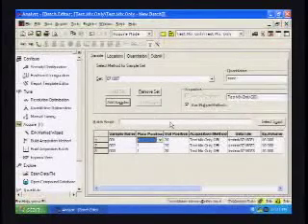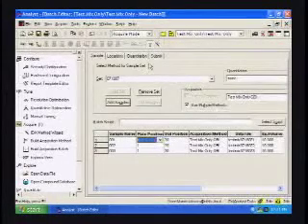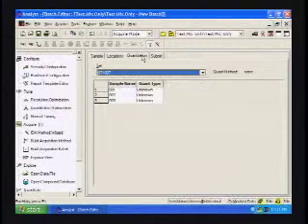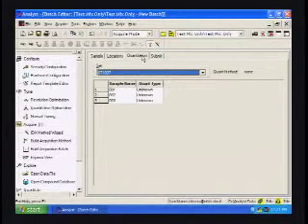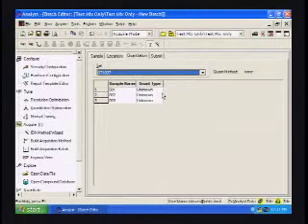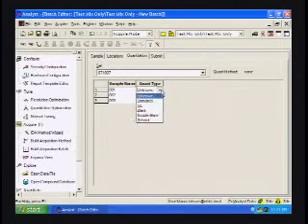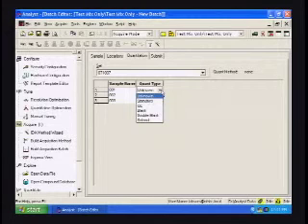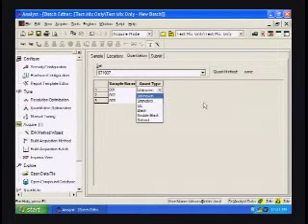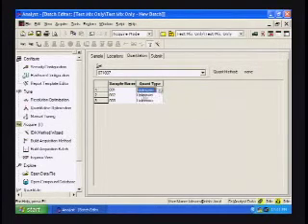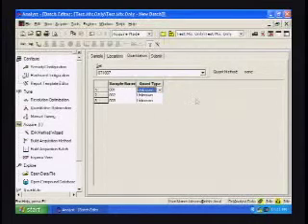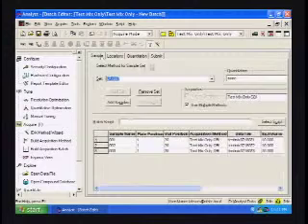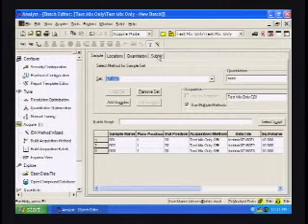If we were doing quantitations, this is just for future reference, we could designate what sample type this is. Whether it is unknown, standard, QC, blank, double blank, or a solvent. Which helps fill out the quantitation table, as you'll see when we get to that.